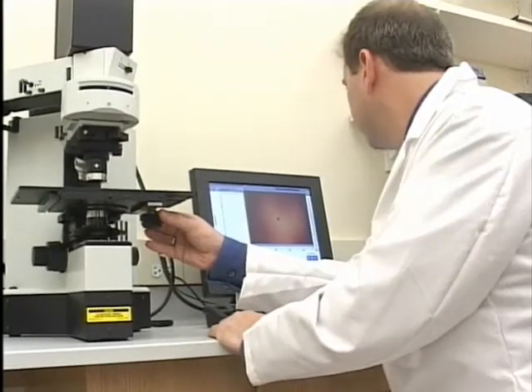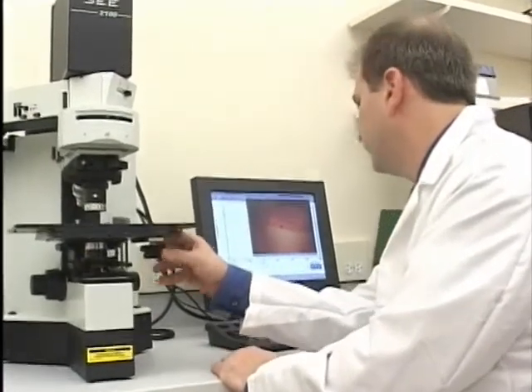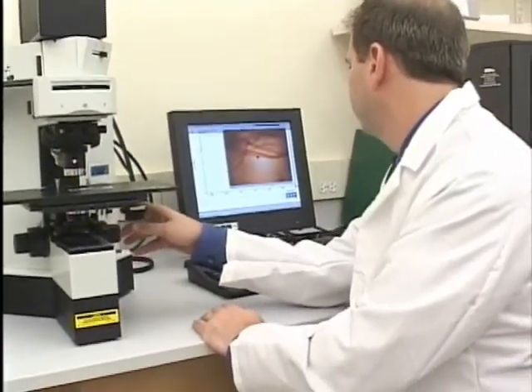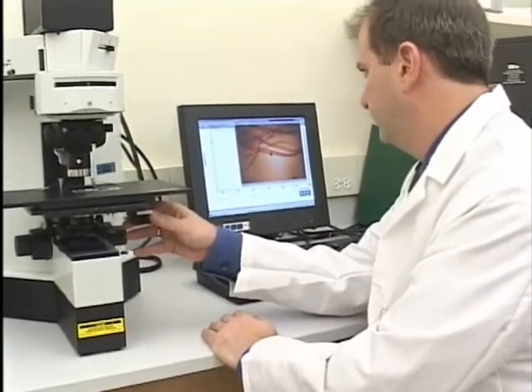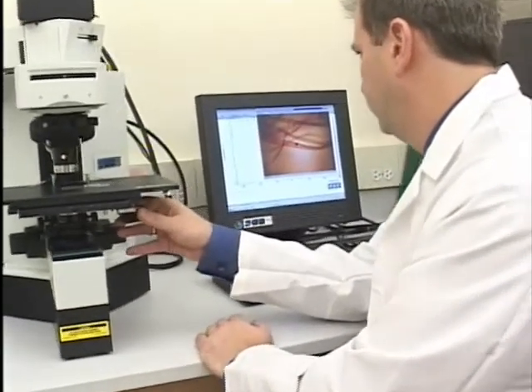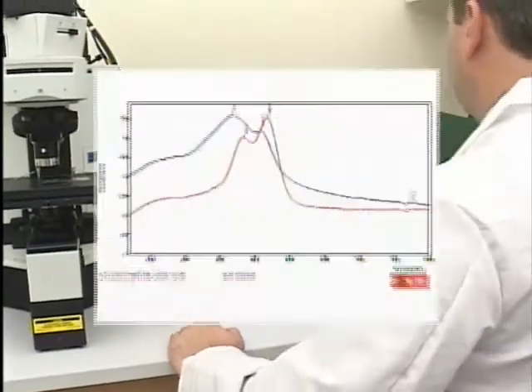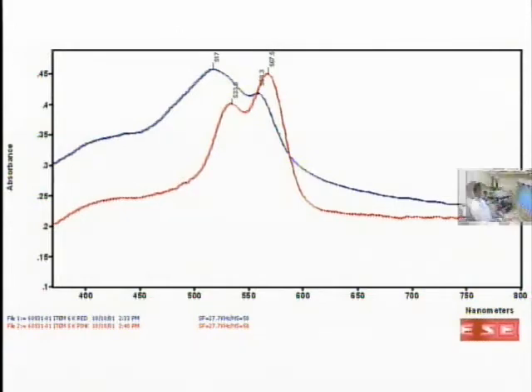Another station is the Micro Spectrophotometer. Similar to the FTIR in using light to examine the characteristics of evidence, this instrument uses light in the visible and ultraviolet regions of the light spectrum. The instrument can provide information on dyes and pigments and is able to differentiate color about ten times better than the human eye.